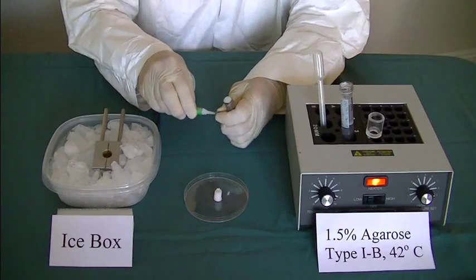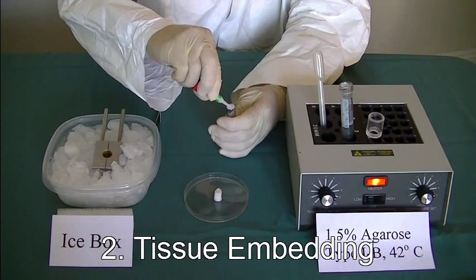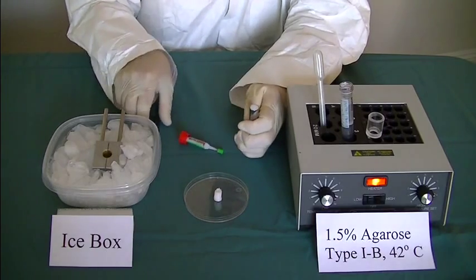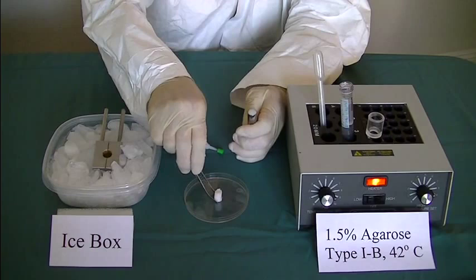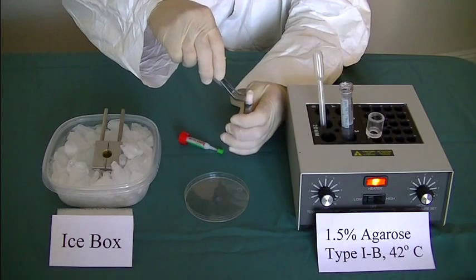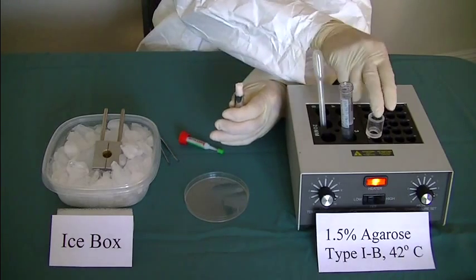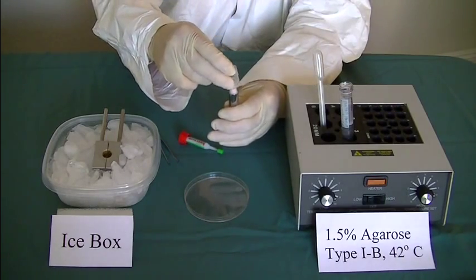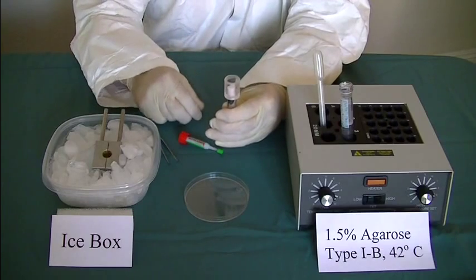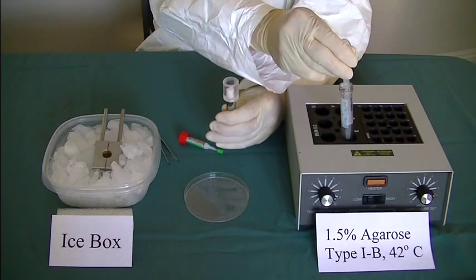Tissue Embedding. Apply a small drop of crazy glue on top of the plunger. Glue tissue core on the plunger. Put the embedding ring on the specimen syringe. Pipet warm agarose into the embedding ring.